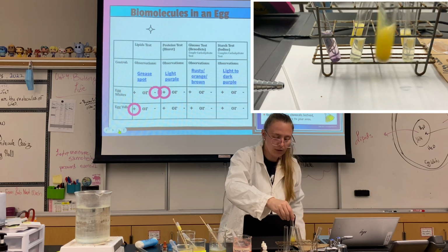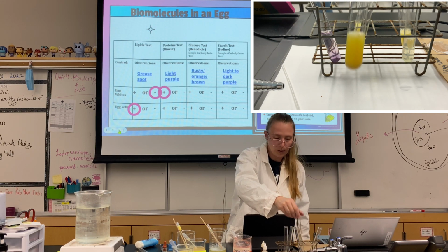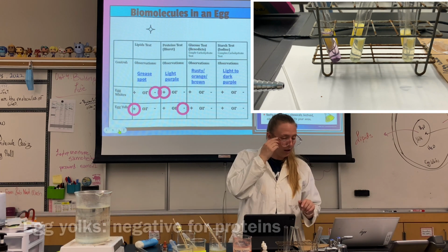So as you can see with the other one, it was an immediate reaction. Swirl, swirl, swirl. I'm not really seeing any purple. So that is a negative. We don't have any proteins in our egg yolks.